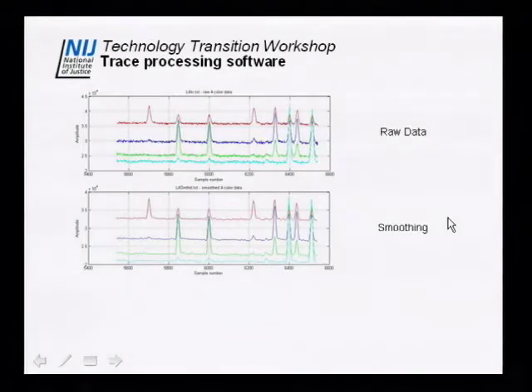So in terms of data analysis, if you look at a trace of raw data, it typically looks like this. It's really messy. And by messy, I mean, first of all, what you see are baselines that are not all lined up together. Secondly, you see bleed through. For example, here, this would be a blue dye that's going through the system, but then the blue detector picks it up, the green detector picks it up, the red detector picks it up as well. So for one dye, you get signals from all your detectors.